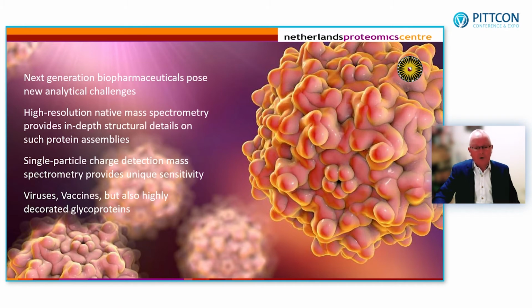The single particle charge detection mass spectrometry on an Orbitrap provides unique sensitivity and allows us to analyze very complex, structurally complex, large biomolecules, as I hope I have showed you here, with viruses or vaccines, but also these highly decorated glycoproteins. So with that, I come to the end of my part 1.